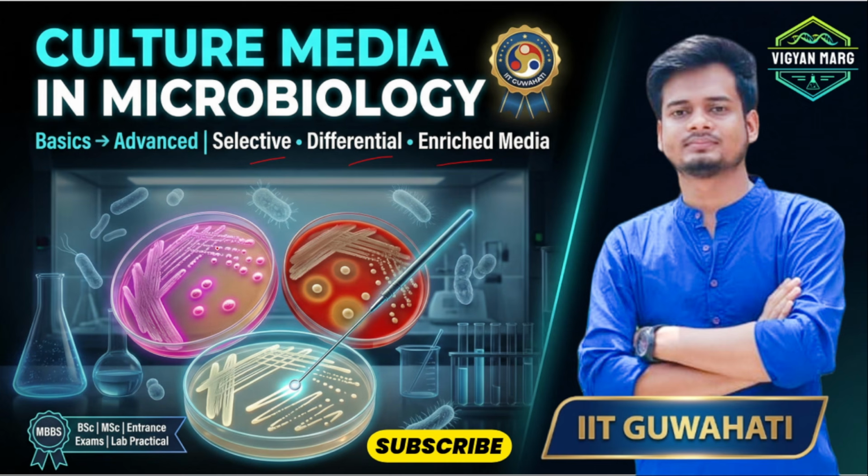This video is going to be very helpful for MBBS students, bachelor's, masters, and other entrance exams like NEET, GATE, and also for lab practical. We will start from the very basics, like what is media, what is culture, and what is agar, and we will go all the way to exam and viva level questions.